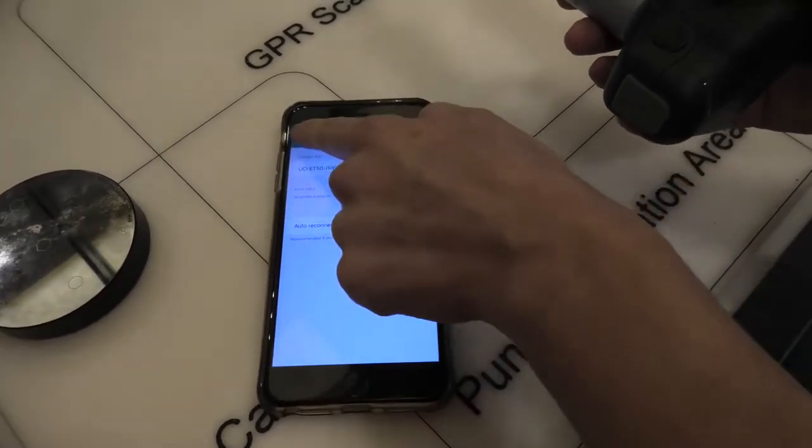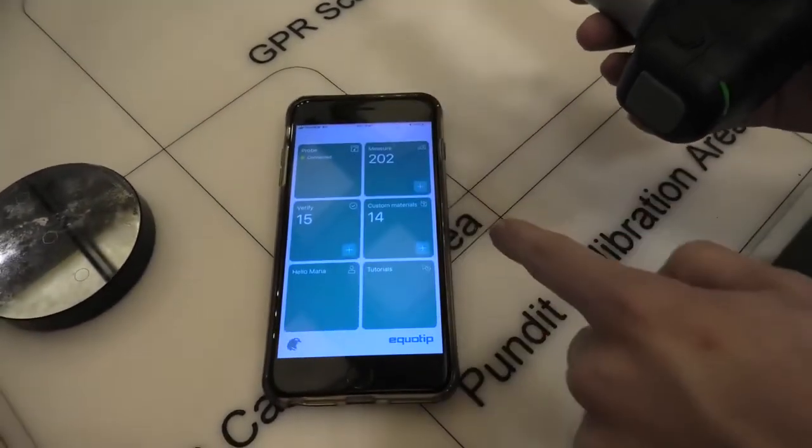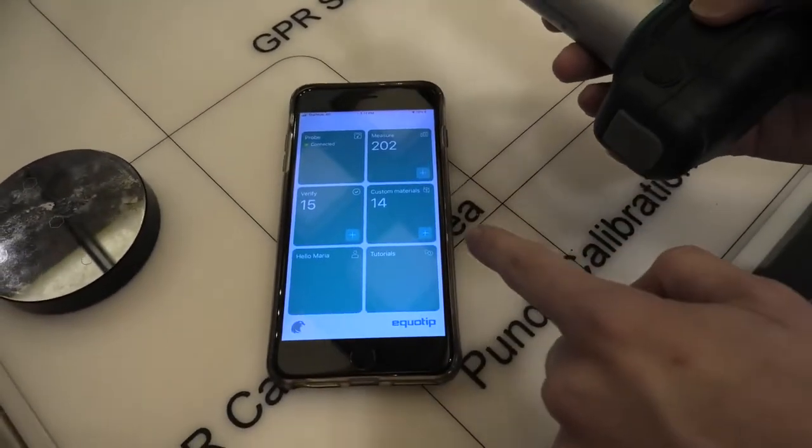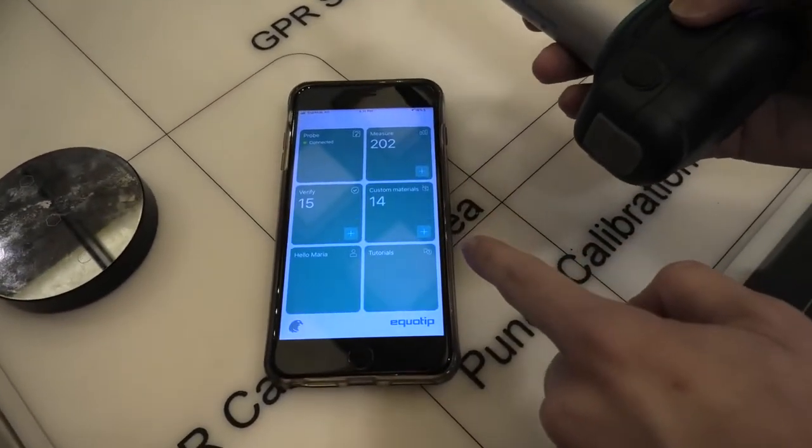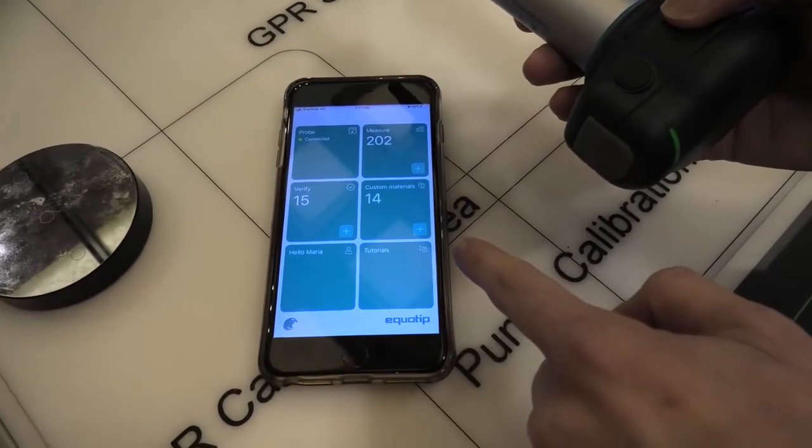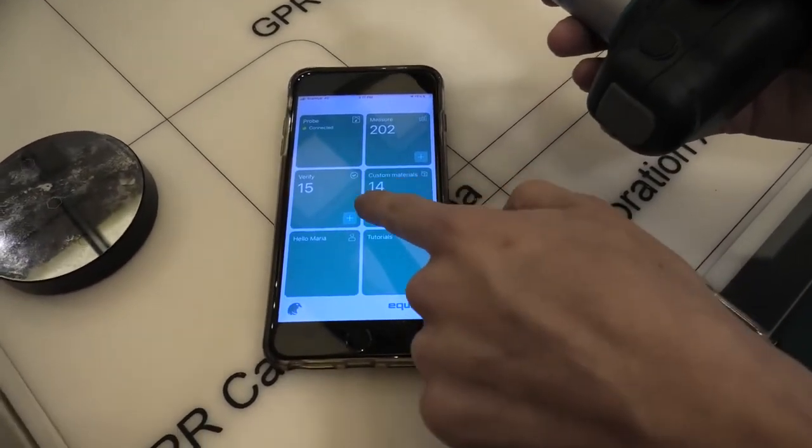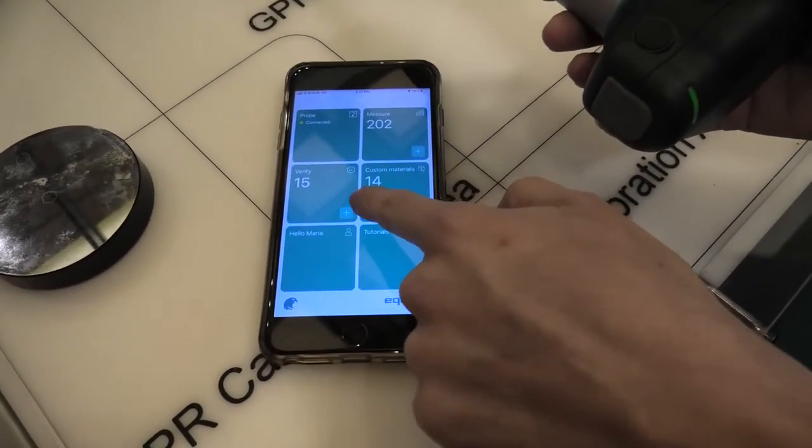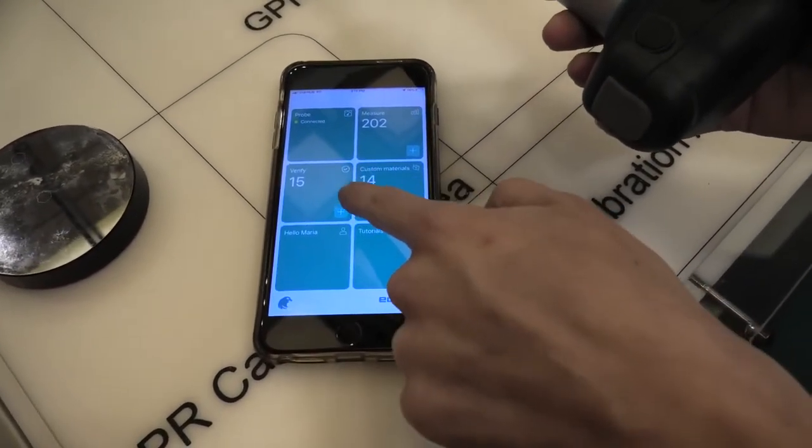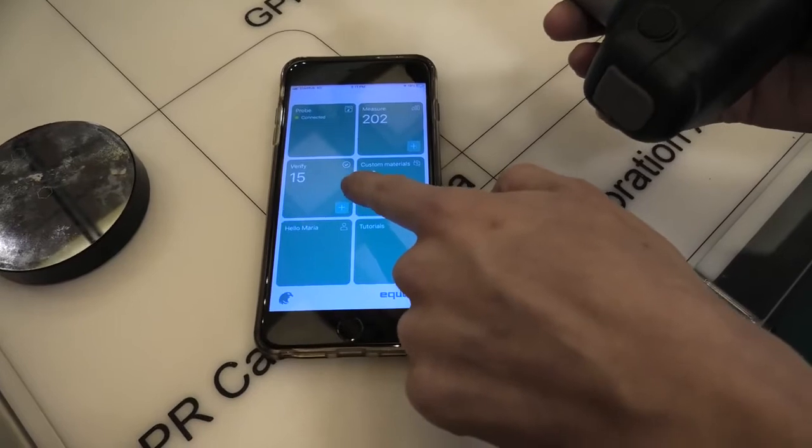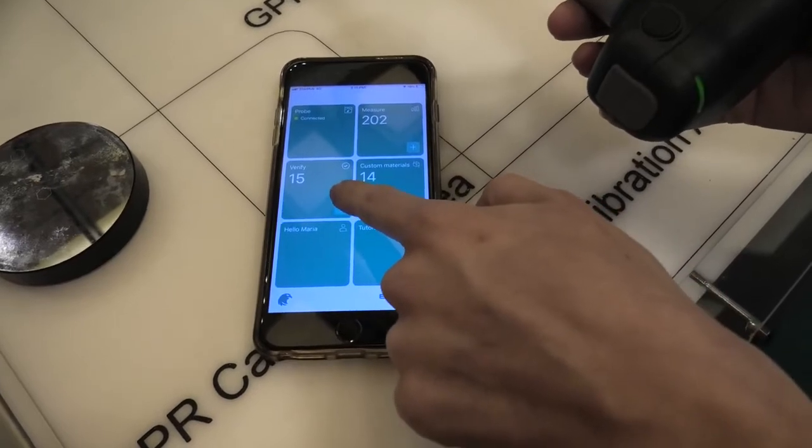And once it's connected, the next step is to verify our probe. So here we click on the plus sign, verify, for a new verification.